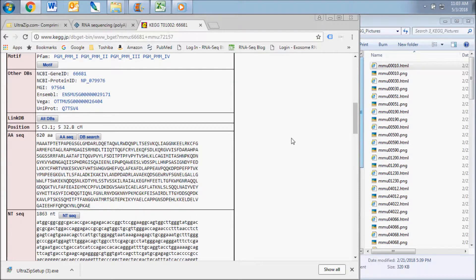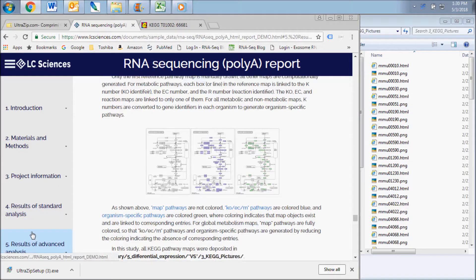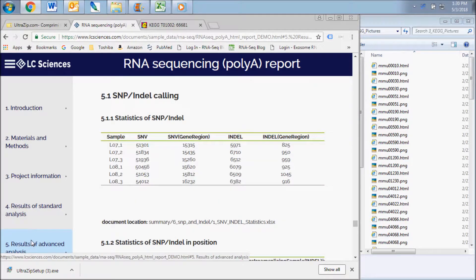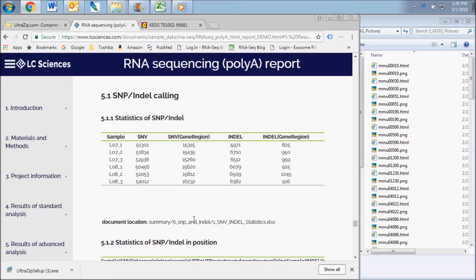If you requested advanced analysis with your order, your report will contain sections for mutation and alternative splicing analysis. The SNPs and indels results subsection displays data contained in the SNP and indel folder.